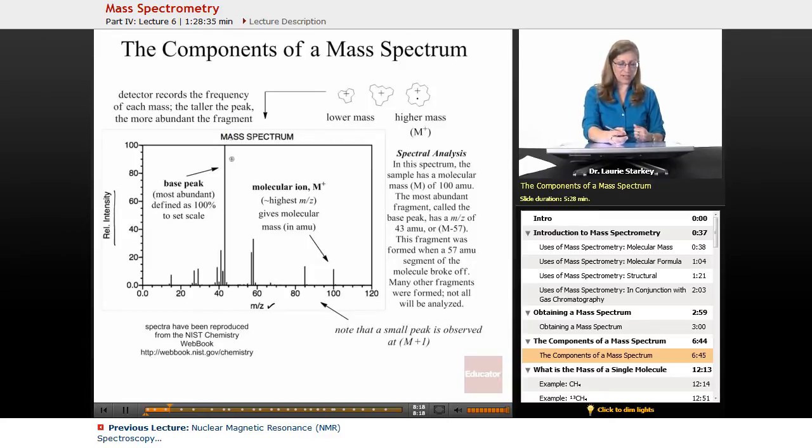Now, why do we have a lot of this fragment? The way you read a mass spec is you can literally just count over from these labeled hash marks, count over to see what mass we have. So here's 40. So this is 41, 42, 43. So this is a mass to charge of 43. And that's our base peak. Why do we have so much of that fragment? Why did that occur so much? It must be a very stable fragment. If this is a stable fragment, a stable cation or radical cation, if it's very stable, then it's more likely to be formed and it's going to be showing up in a higher abundance.